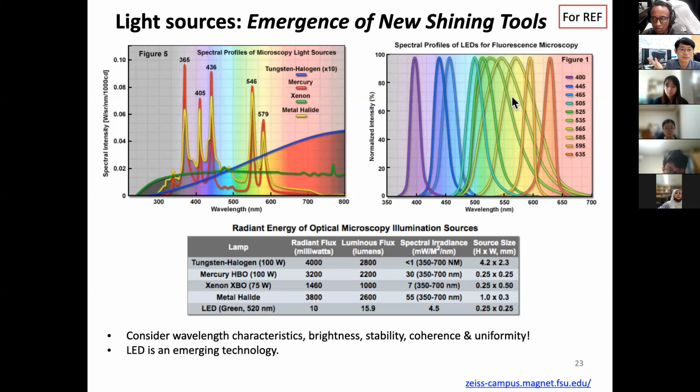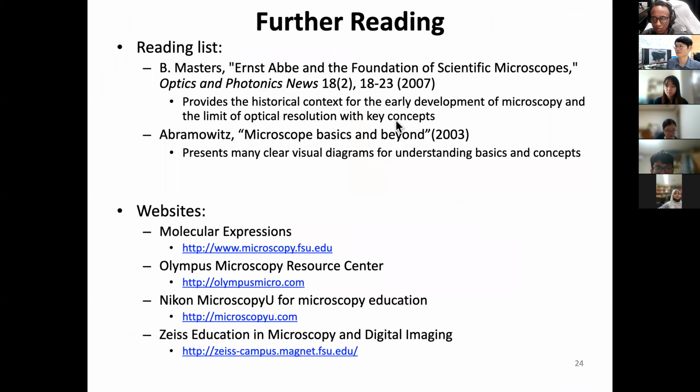It sounds good because it's white light, but in fact, the white light LED is usually a combination of a yellow LED plus a blue LED. So it actually has a slightly weird spectrum. If you look at the spectrum, there's a peak in the blue and then a broad yellow part. That combination gives us a kind of yellowish white light, but you have to think about it in terms of the spectrum, okay? So that's a little different from typical sunlight.